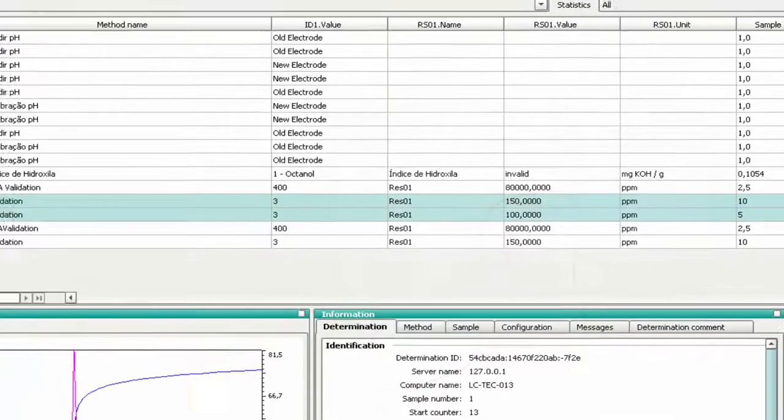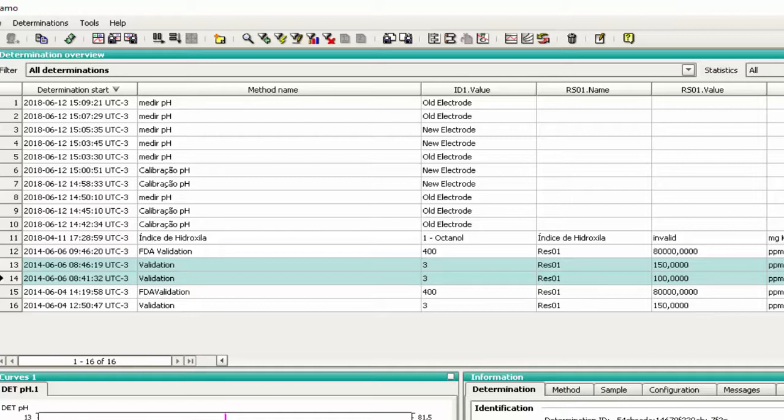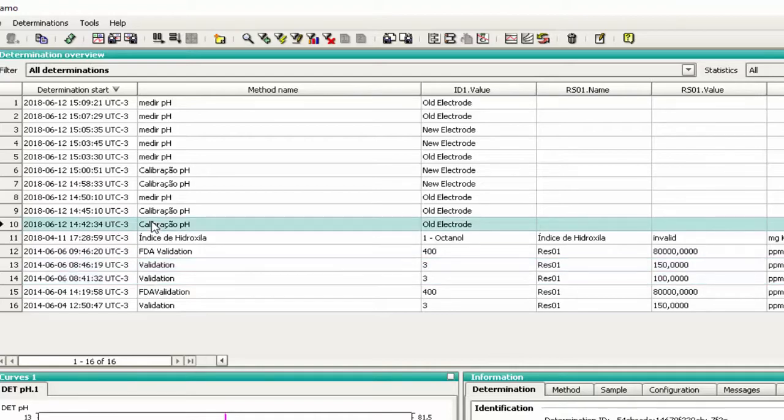Last but not least, we will see the reprocess function. This function is very important, especially when there's some typing error, like mass or sample name, or when there's an error in the calculation or problems in recognizing the equivalence points. Select the sample that you want to change some information.